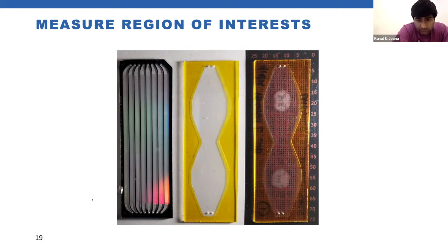so we have full volume of the pumps. And then when we section tissue on, we print out a slide ruler or grid onto a piece of transparency. And then we just measure out a lower left and an upper right bounding box of the section and input that into our config file. And the HiSeq will go back and calculate the stage positioning for each region of interest and image the entire section.